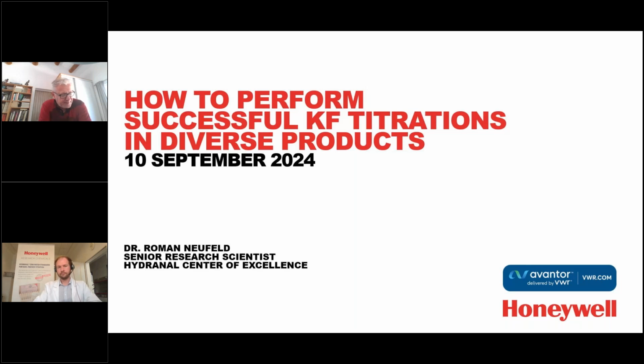This presentation will be made by Dr. Roman Neufeld from Honeywell, and thank you very much in advance. He will explain how the Karl Fischer application can be adjusted based on the sample properties to avoid misleading results. He will also give us many tips and tricks to perform this analytical method and avoid some errors. So I'm sure and convinced that this webinar will be very helpful for you. And after that, I'm sure that you will be more comfortable to avoid issues with your different samples.